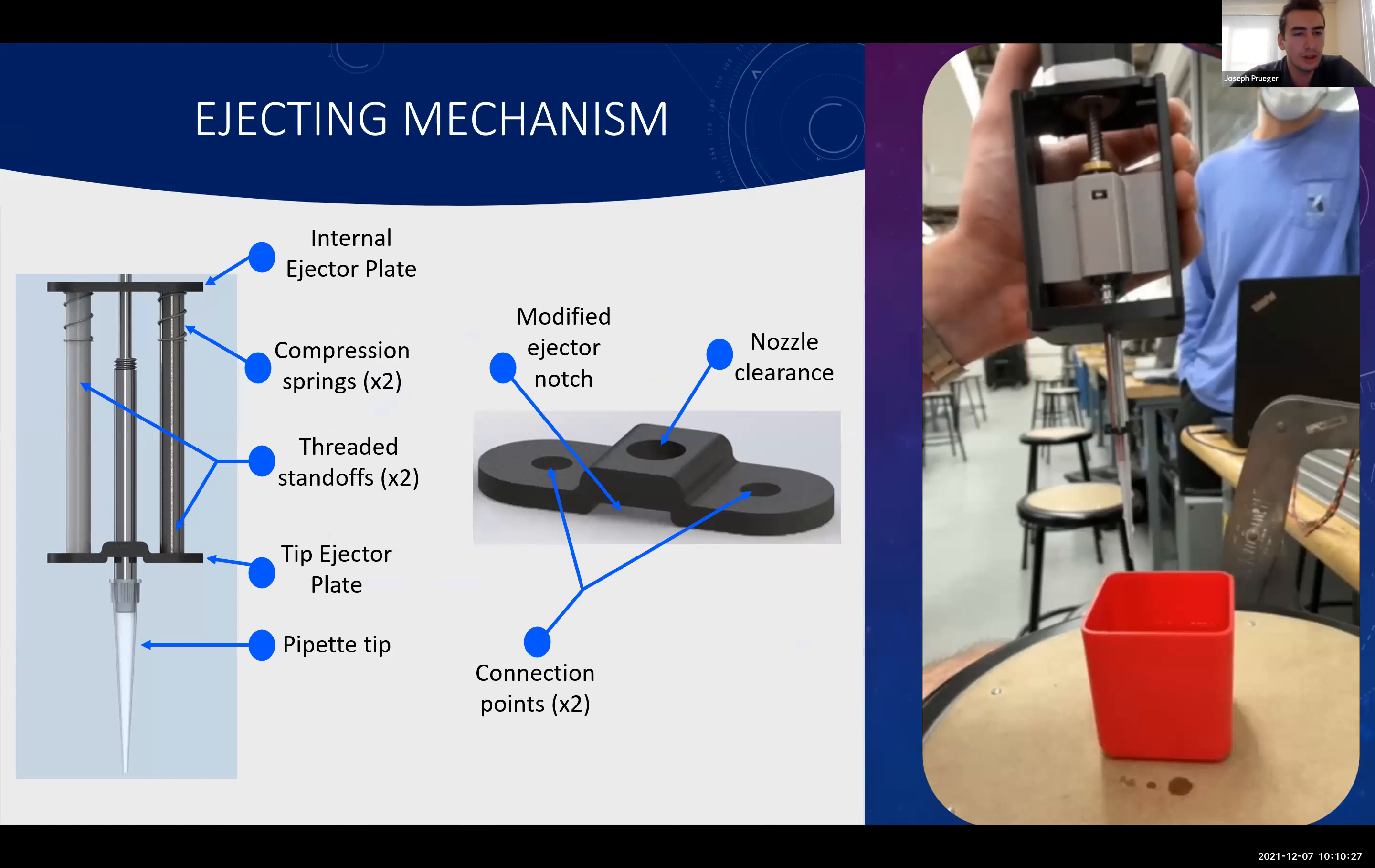Moving on from our liquid handling subsystem, we're going to look into our ejector mechanism. Starting on the left side of the screen at the top, we have our internal ejector plate. This internal ejector plate directly interfaces with the bottom of the spaceship. So when it's engaged, it'll compress our precision compression springs against the bottom of the motor mount. While running through tests, we had some trouble figuring out how to interface from the internal part of our design to the external part of the design to eject the tip. Our team decided on two threaded standoffs that create a more slender look to our design. Connecting to these threaded standoffs are the tip ejector plate, which can be seen in a close-up view on the right side. The cool part about this design is the center notch, and this allows us to dispense the maximum amount of fluid, which as Drew mentioned earlier was 200 microliters, without ejecting the tip until necessary.